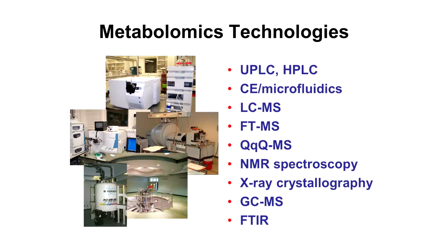We have to turn to crystallography. We, of course, use GCMS. Many groups also use infrared spectroscopy. A whole arsenal of equipment that's very diverse and typically would fill many rooms and which would often extend beyond most capabilities of most analytical labs. But all of these can be and are used. So I'm going to talk about these in a little more detail.